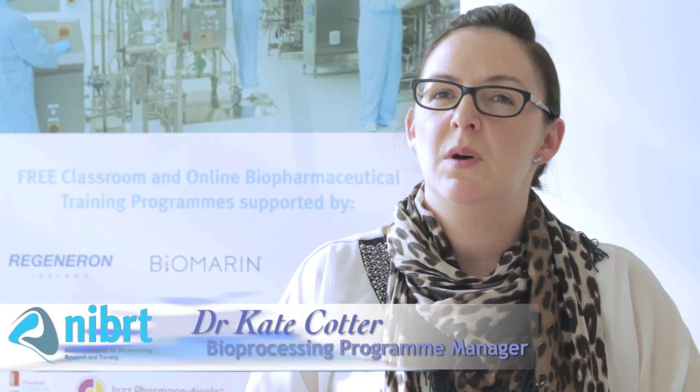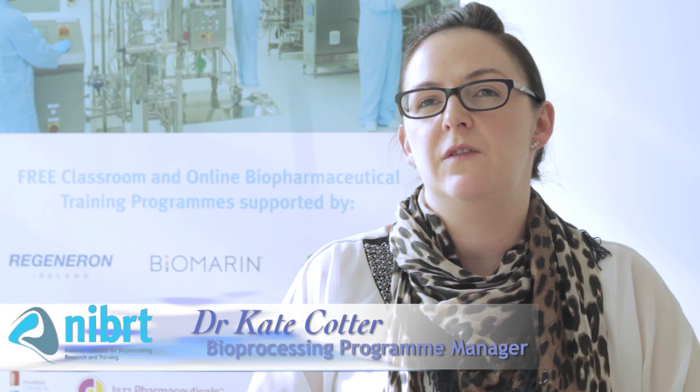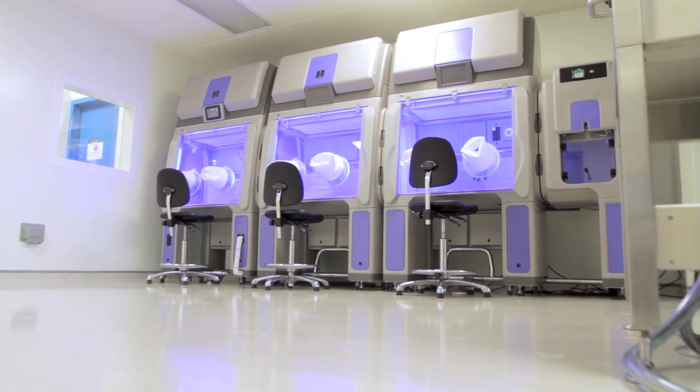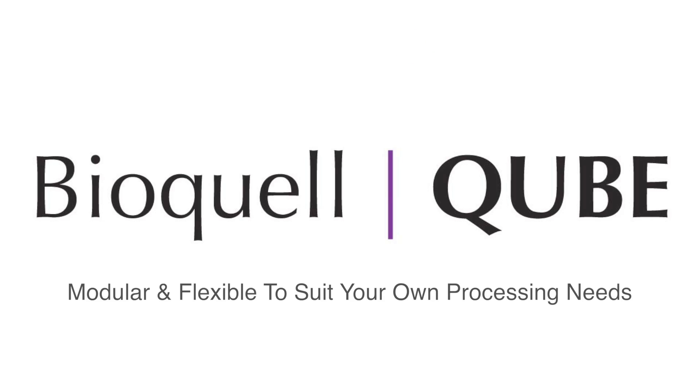I'd recommend the Cube because the modular design allows a lot of flexibility for the end user to design a piece of customised equipment that best feeds their processing needs. The BioQuell Cube — quick to set up, modular and flexible to suit your own processing needs.